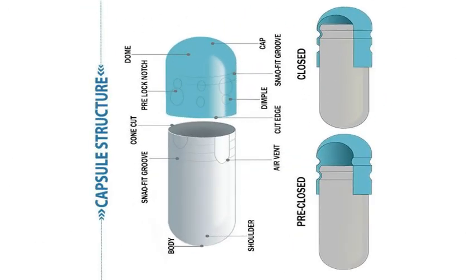If we have a look at different parts of the capsule we can see that it has a dome shaped cap and a body. In both cap and body there are snap fit grooves and in the cap there is pre-lock notch and dimples.